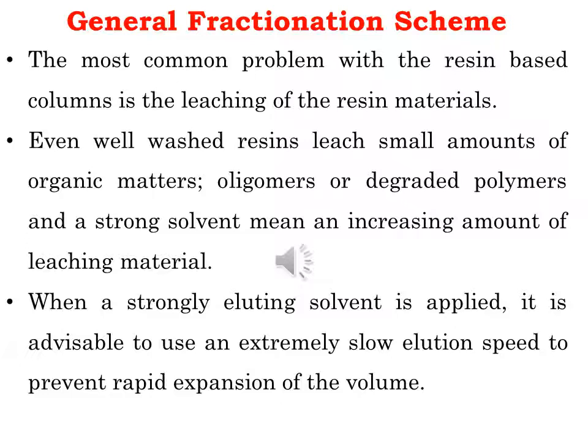It is strongly recommended to clean the resin before use, with exceptions like pre-washed XAD2 for pesticide analysis. All commercial resins need pre-cleaning. First, the resin should be soaked in water in a beaker and small particles must be removed by decantation. This process is especially important because the small particles drastically slow down the solvent speed.